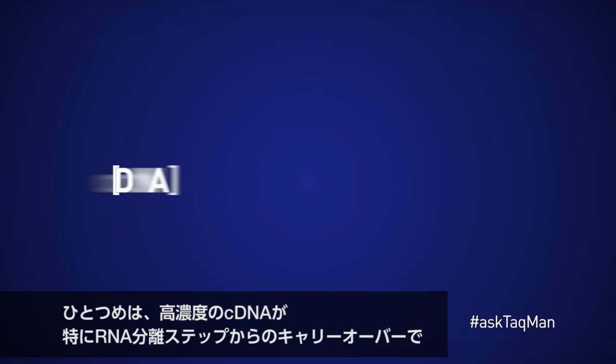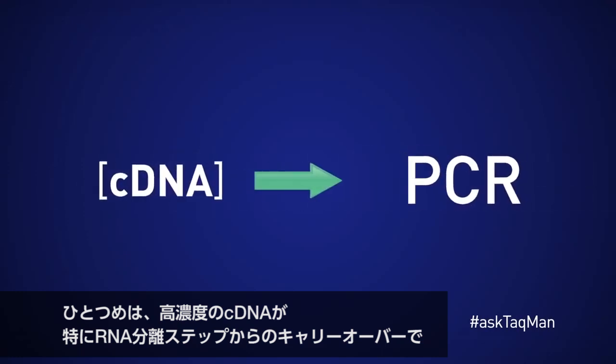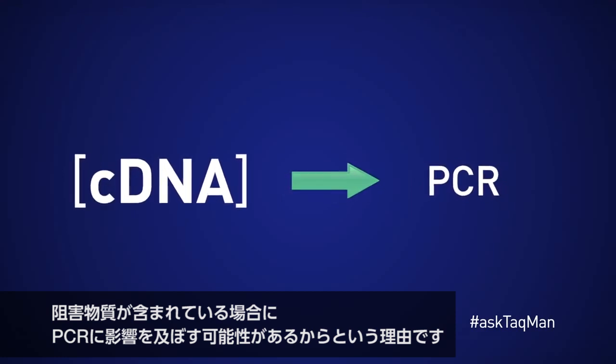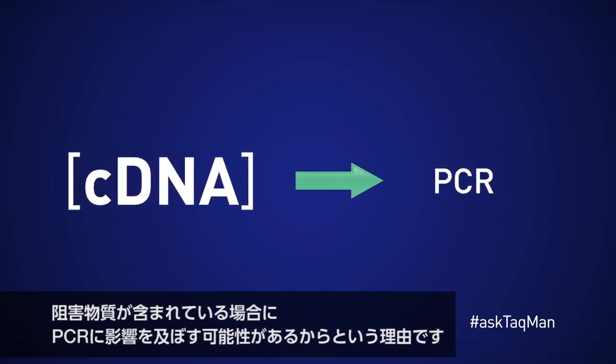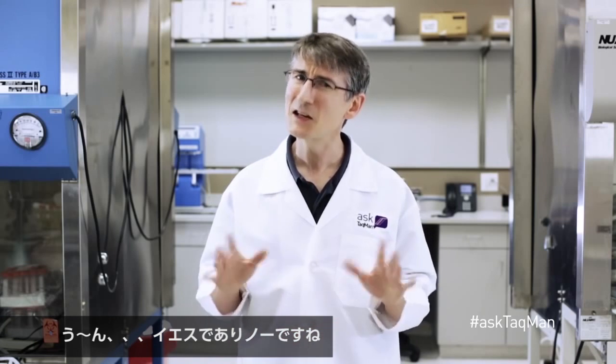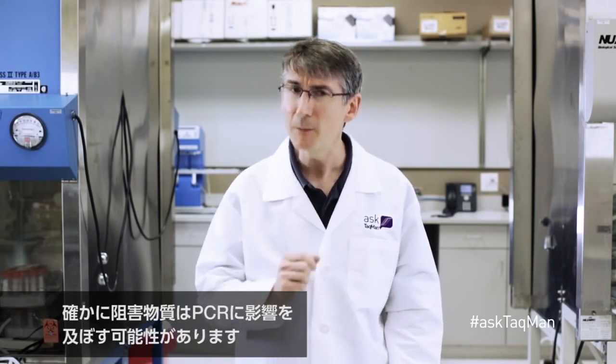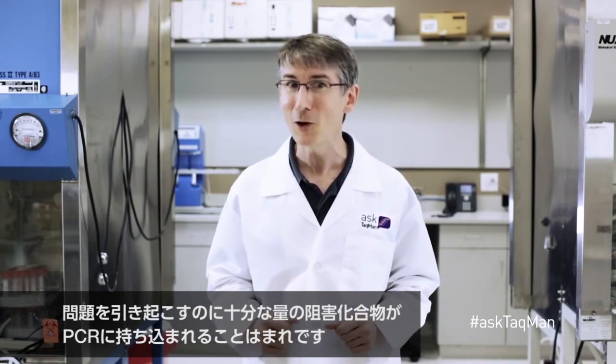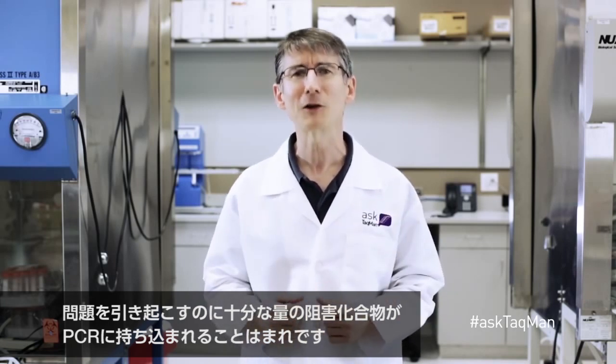First concern: high concentration cDNA might have a negative effect on PCR, especially if it contains inhibitors carried over from the initial RNA isolation step. It's true that inhibitors can have an impact on PCR, but cDNA tends to be fairly dilute and so inhibiting compounds are rarely introduced into PCR at sufficient quantities to cause problems.